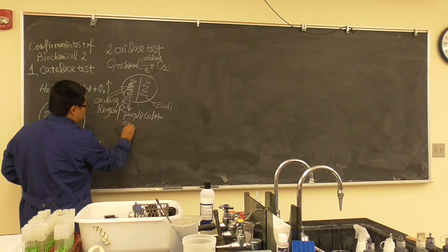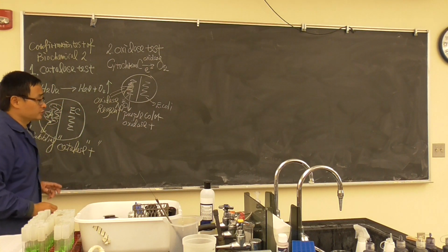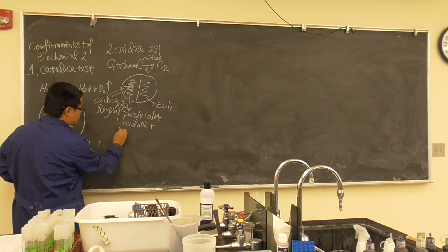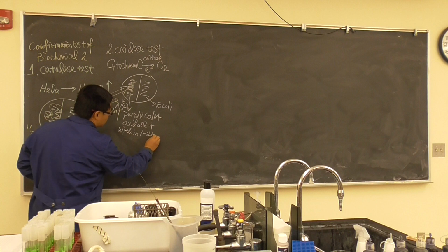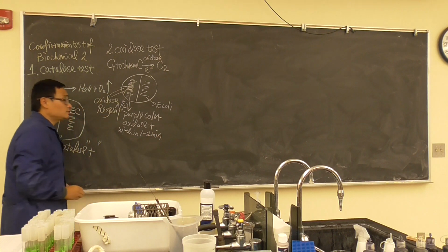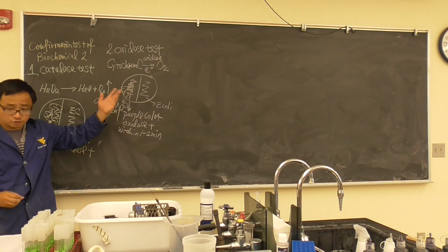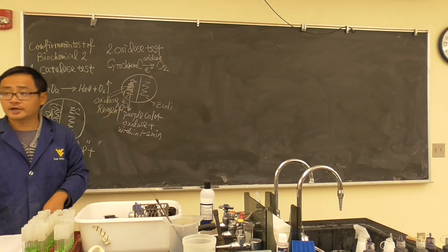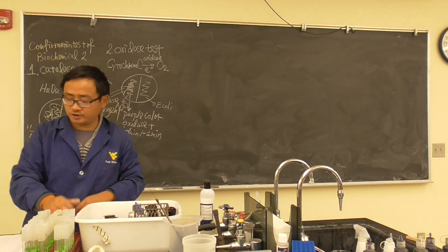That means oxidase test positive. But be careful, you have to do this within 1 to 2 minutes, because otherwise everything will become positive. The reason is it's going to be exposed to the air. Okay, so that's the oxidase test. You can see very clearly Neisseria is positive.